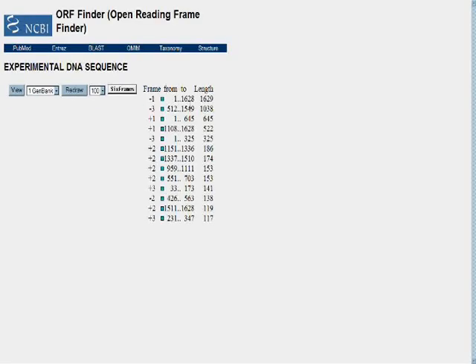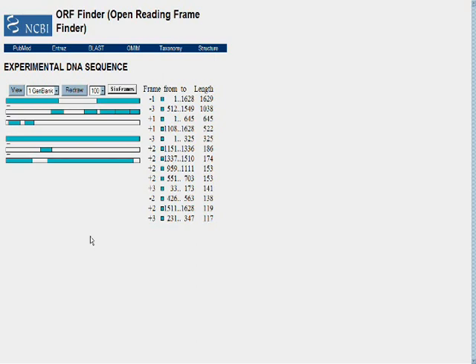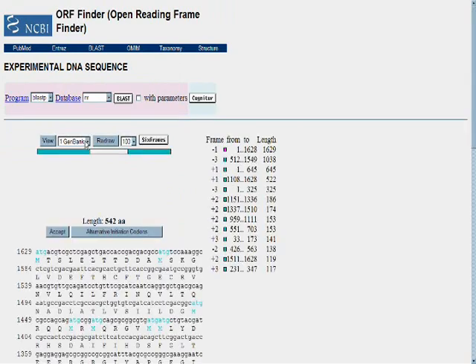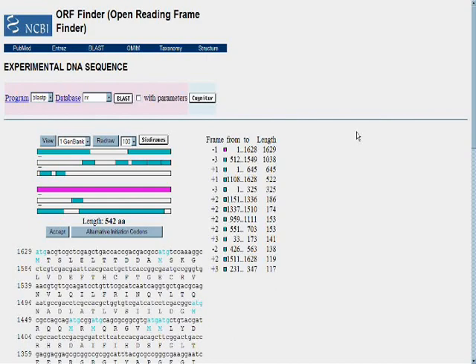That will start the algorithm along its way, looking for the longest open reading frame among the six potential open reading frames one would expect. As we can see from our first result, we do in fact have one out of the six reading frames that contains a very long stretch of coding, and we can select that particular stretch by moving our cursor over it and then clicking.